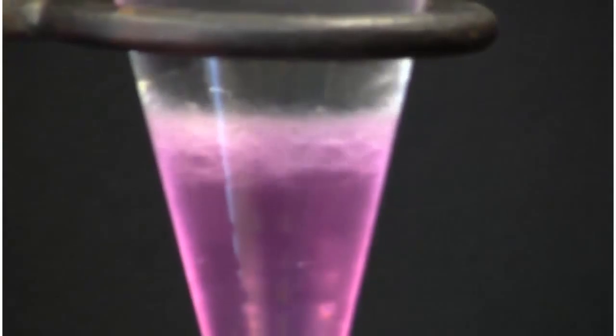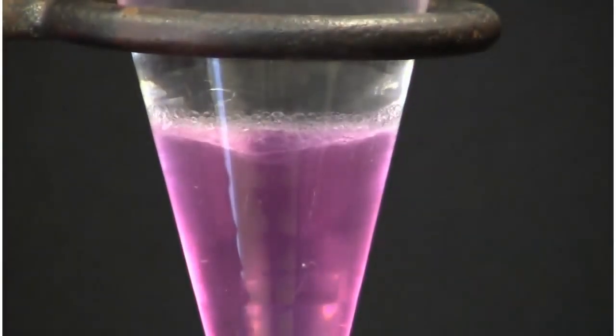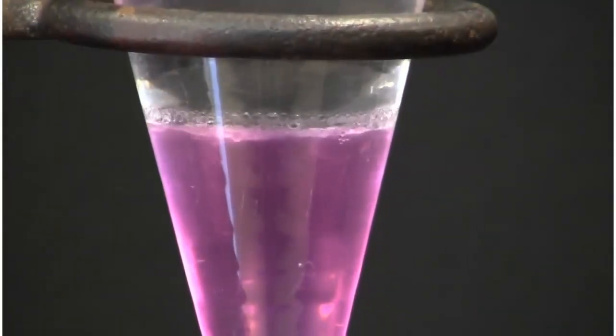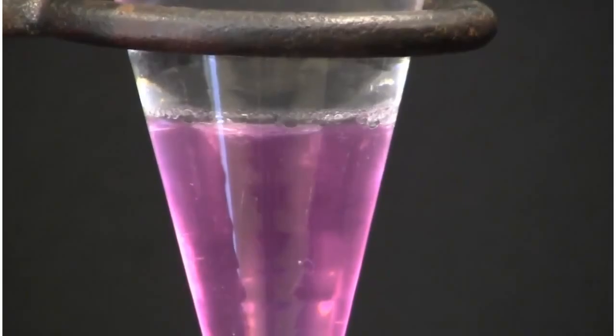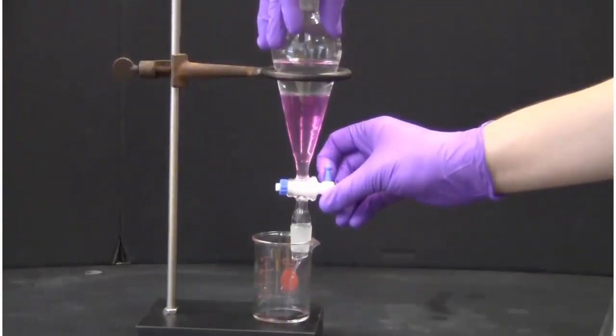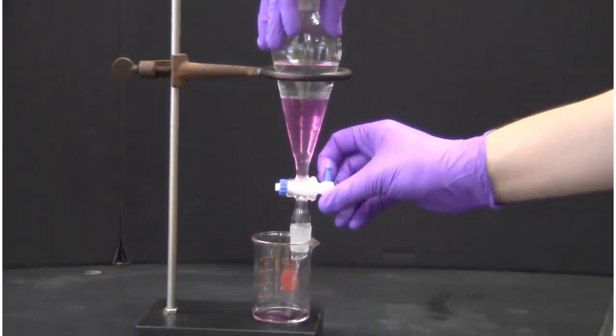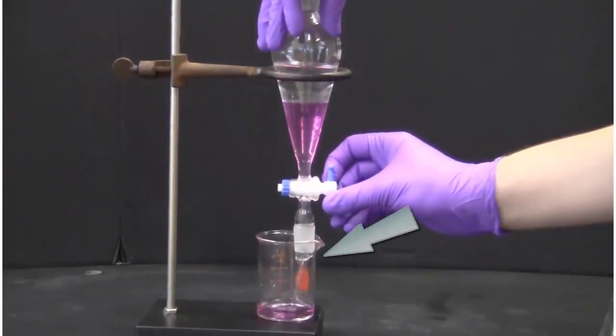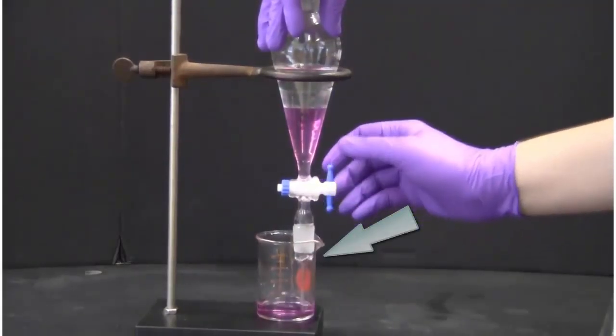Once the contents in the funnel have settled you will see two layers form. Wait until the two layers are completely separated then transfer the lower layer into a beaker or Erlenmeyer flask by slowly opening the stopcock. Placing the end of the glass tube on the side of the flask or beaker helps avoid splashing.